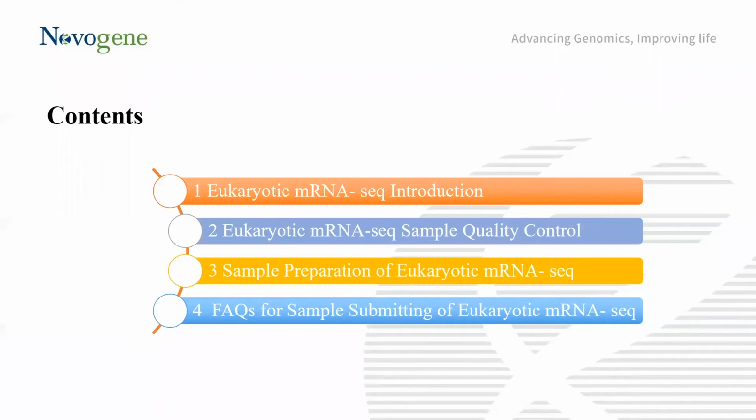The content of this topic has been divided into 4 parts. The first part is eukaryotic mRNA-seq introduction, the second part is sample quality control, the third part is sample preparation for eukaryotic mRNA sequencing, and the last part is the frequently asked questions for submitting samples for RNA-seq surveys.